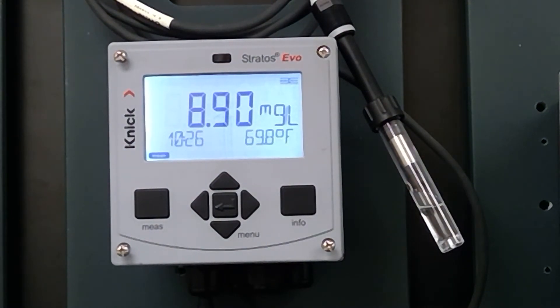Hello, this is Ron Bridges. Today we want to show you how to calibrate, or do a basic calibration, on an SE 715 with a Stratos Evo. This will be a calibration for an amperometric Clark cell sensor where it's going to be in an immersion style application or a pipe that is at ambient pressure.